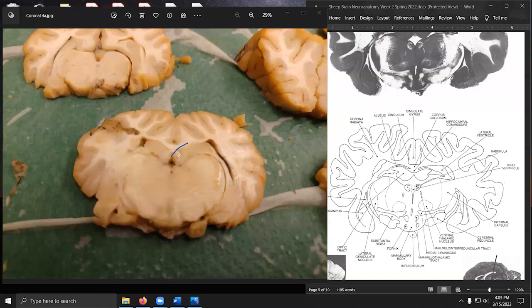We've got hippocampus here. And also down here, they're being connected by the fimbria here. We've got top of the third ventricle here, habenula up there. The bottom of the third ventricle, not really visible, but we kind of know it would be right about here-ish. We have a cerebral peduncle being roughly about there. Can't really make out substantia nigra in this prep.